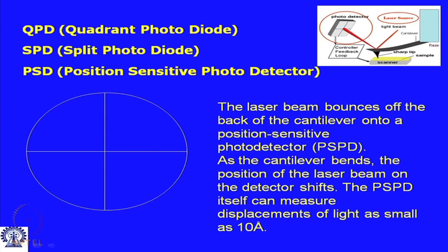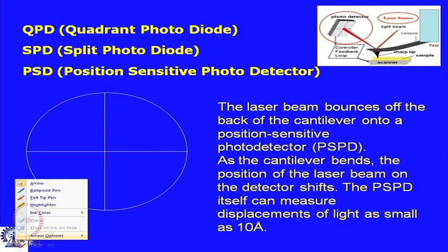If you look at this particular figure towards the right side of the screen, probably it makes much more sense to you right now. You understand that there is a piezoelectric element, which is the scanner essentially. We will discuss a little bit more on the scanner today. You understand this sharp cantilever, and what exactly is its role. You also understand that there is a sharp tip which is used for actually probing the surface.